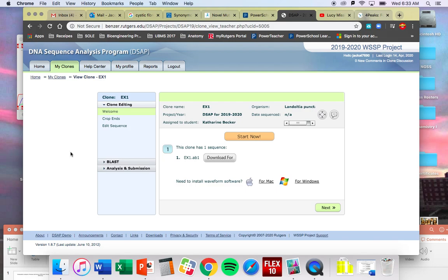I definitely miss seeing you guys, but I'm excited we're able to keep the research spirit alive, and I'm excited that we're now taking a look at your unknown clones. So I'm hoping that on Monday you were able to complete your post survey and send your email to wssp@waxman.rutgers.edu requesting that they release your unknown sequence.